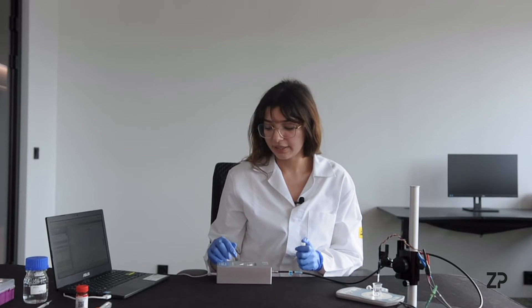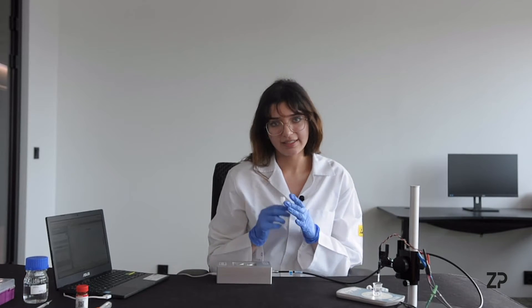Hi, my name is Siobhan and today we're going to be doing a demo using our lactic sensors. For this experiment you will need our lactic sensor of course.